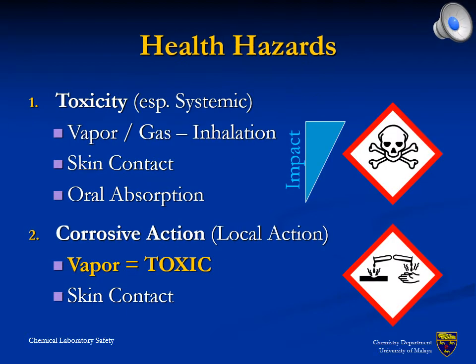Health hazards refer to different levels of toxicity. The systemic toxics immediately affecting life are characterized with a skull. Local acting chemicals are typically labeled as corrosive. The impact of a toxic depends on the route for the exposure. Attention should be particularly directed towards intoxication via inhalation and upon skin contact. Such chemical hazards require special precaution for safe operation inside the lab.